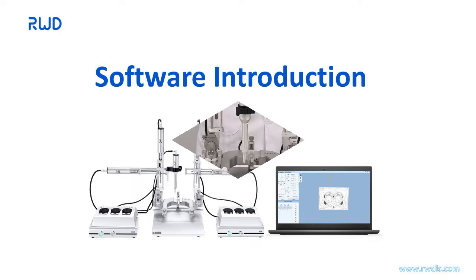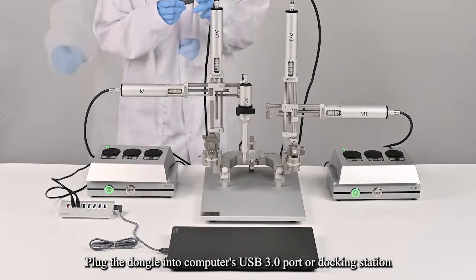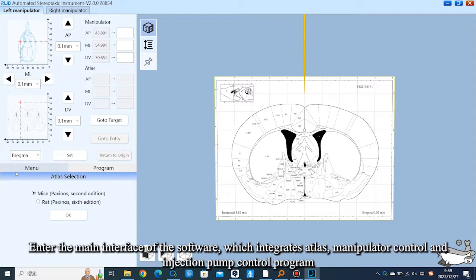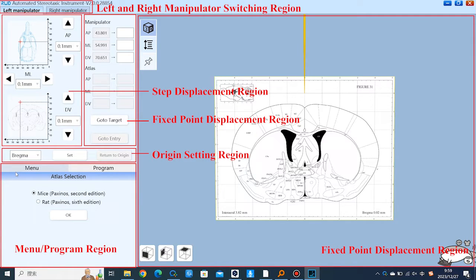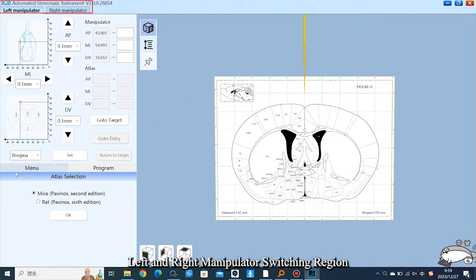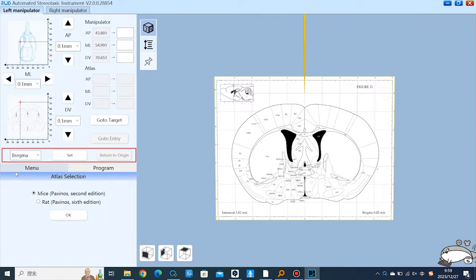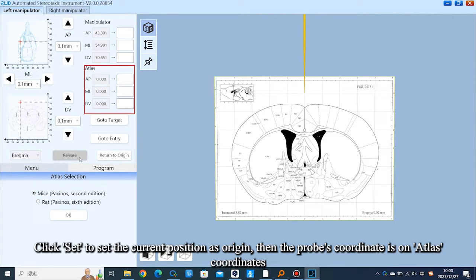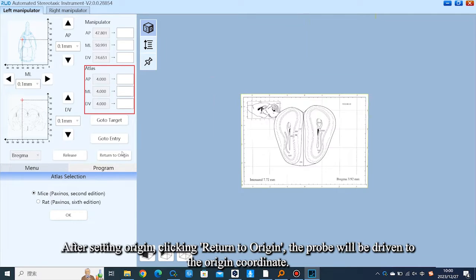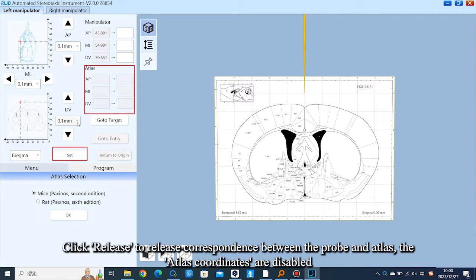Software introduction: check that the stereotaxic hardware is well connected and turn on the power switch on the control box. Plug the dongle into the computer's USB 3.0 port or docking station. The main interface integrates ATLAS, manipulator control, and injection pump control programs. The left and right manipulator switching region allows switching between sides; note that if a manipulator control box is not connected, you cannot switch to that manipulator's interface. In the origin setting region, users can set the current position as bregma or lambda point. Click Set to set the current position as origin; the probe's coordinate will then be on ATLAS coordinates. Click Return to Origin to drive the probe to the origin coordinate. Click Release to release the correspondence between the probe and ATLAS, disabling the ATLAS coordinates.